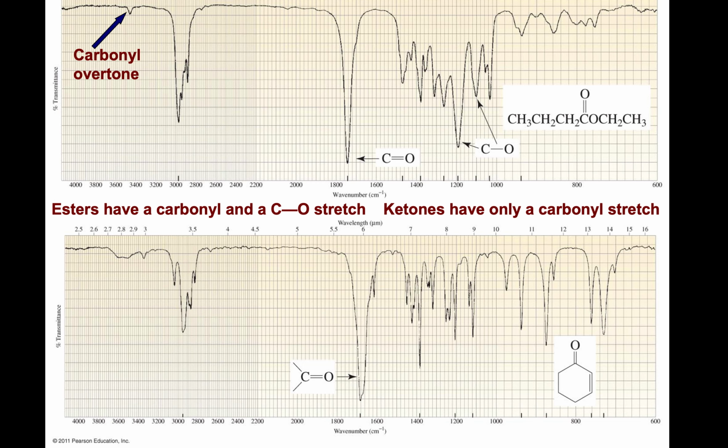If there were water, it would have a big broad stretch there. That's not water, that's not an impurity, that's a carbonyl overtone. You studied that at a higher level. Okay, this is an ester, and that's a carbon-oxygen double bond, CO single, OC single. That's an ester functionality. Arguably the most important functional group in industry is the ester in compounds of commerce. There's your carbon-oxygen of the ester. That's about 1735 reciprocal centimeters. And there is the CO single for this one. There and there, symmetric, asymmetric.